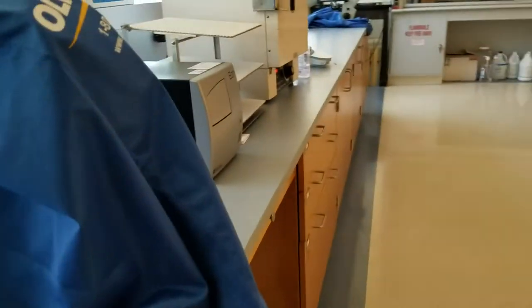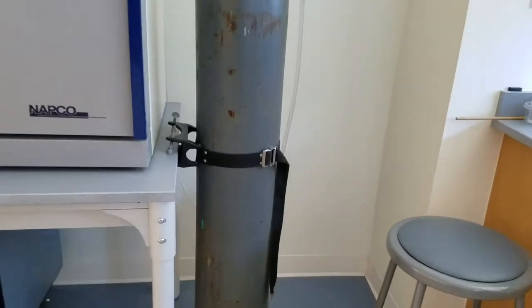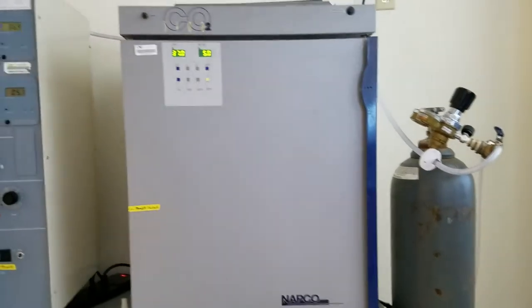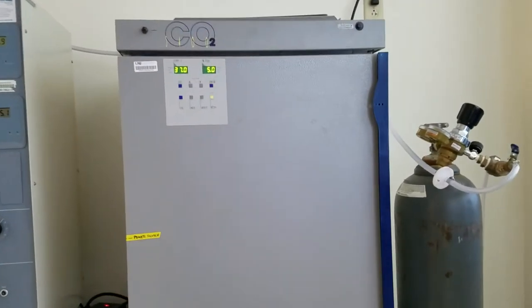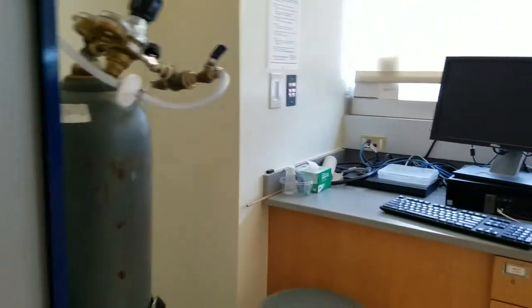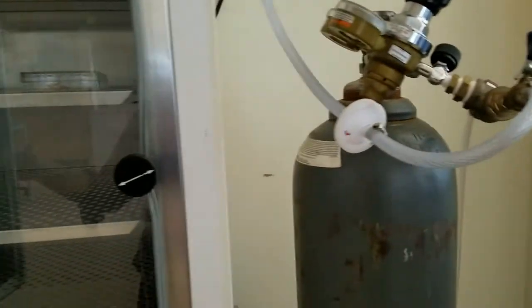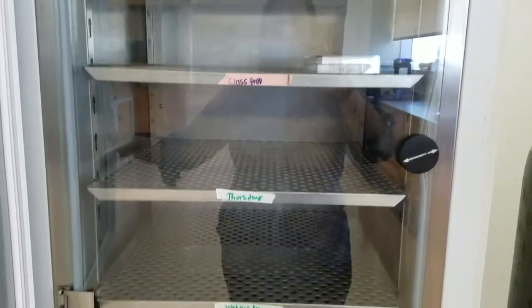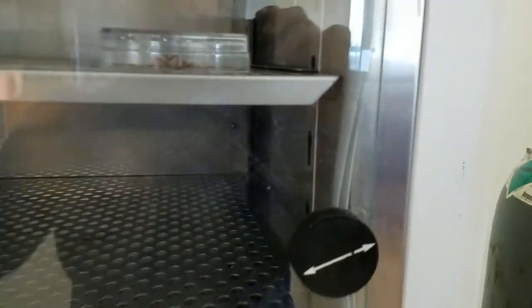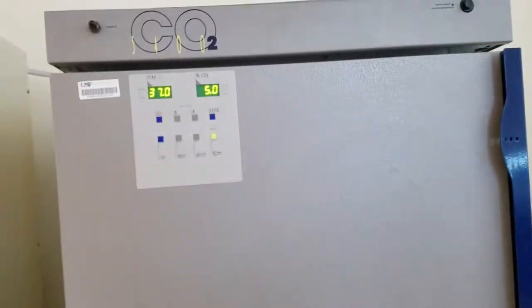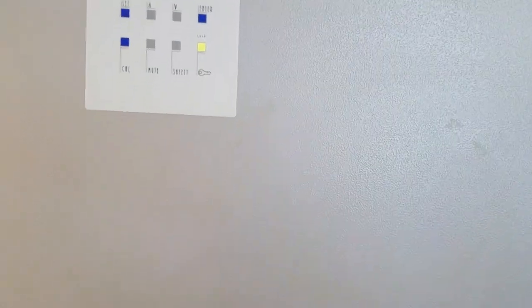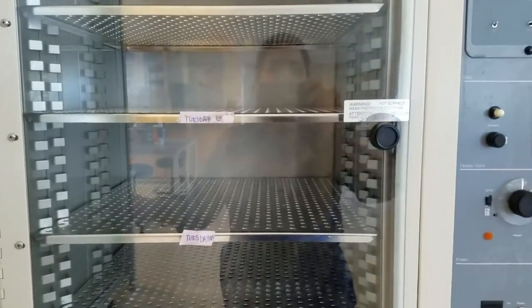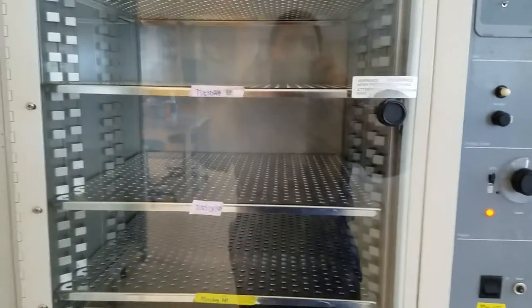Here is our CO2 tank. The CO2 tank is attached to the CO2 incubators. These are water jacketed incubators - there are coils of water all along the walls inside, between the outer and the inner chambers. Inside you have shelves that we keep ourselves in. We use a water pan in there to maintain humidity as well. These incubators are used to maintain the physiological environment for these cells to grow in, so they will be kept at 37 degrees Celsius and 5% CO2 to maintain that environment. We have multiple ones so each lab has a separate shelf that they use.